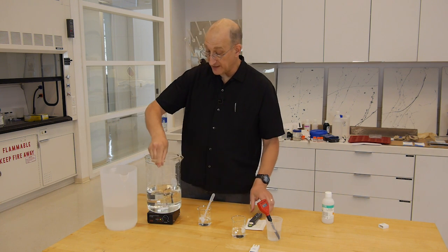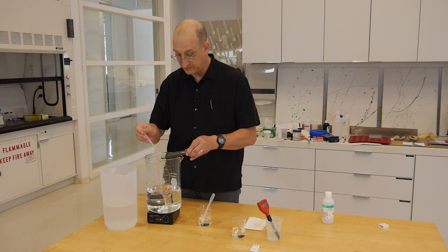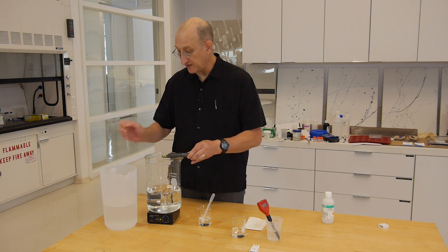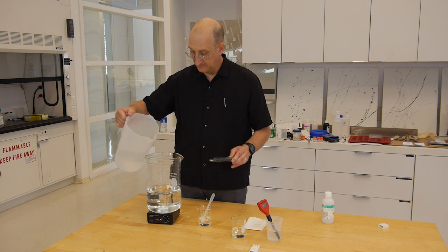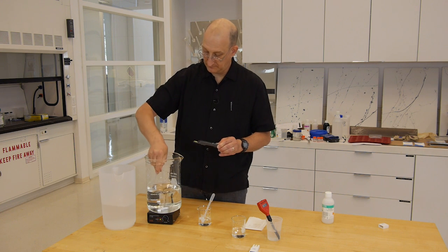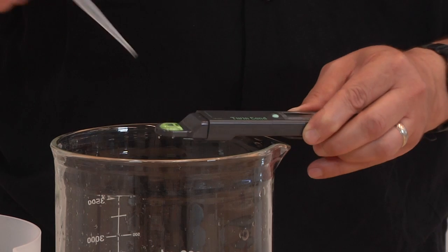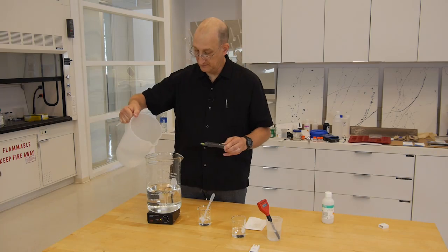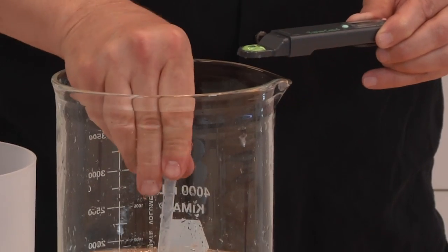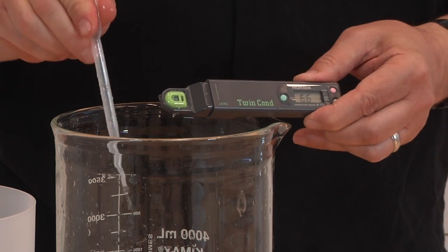And this is distilled or deionized water. Obviously, if we're controlling the ionic strength, we want to have water with essentially no ionic content. So we're at 7.6 now. 7.1, 6.6.